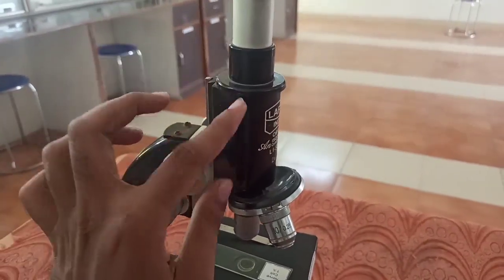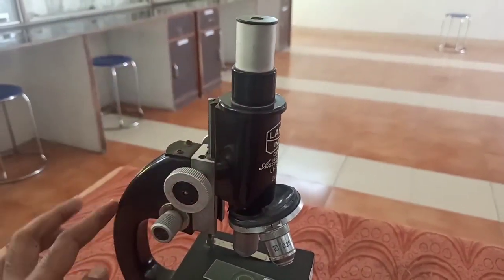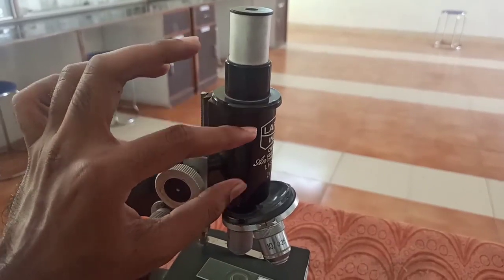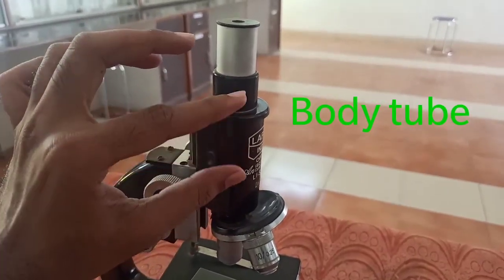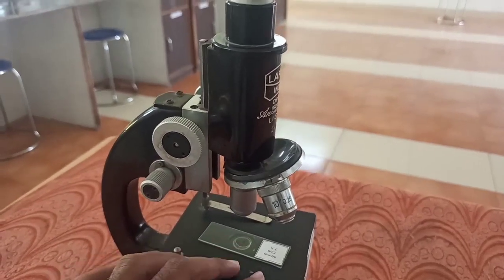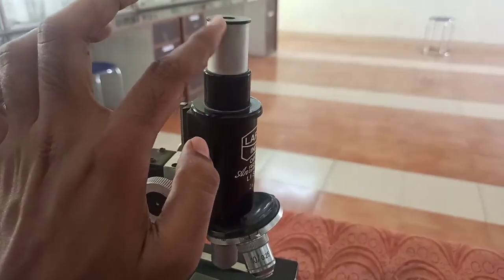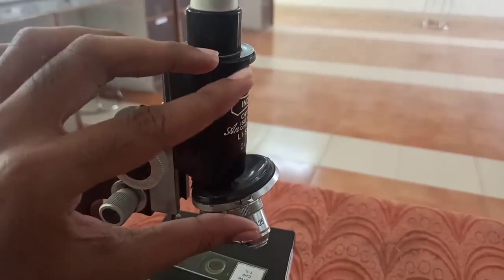Now, this region which is connecting the ocular lens and the arm — this region is called the body tube. The body tube is a hollow tube which is going to send the image formed from the stage towards the ocular lens or eyepiece.